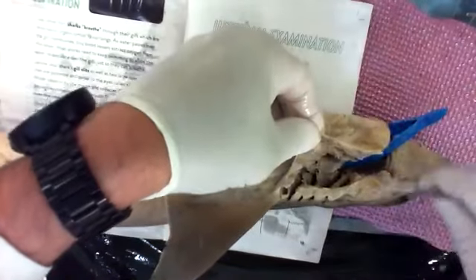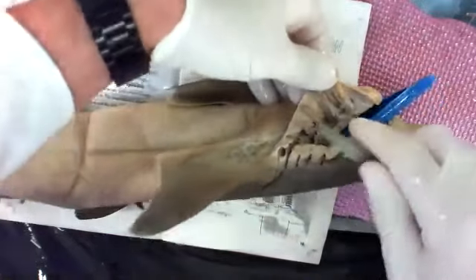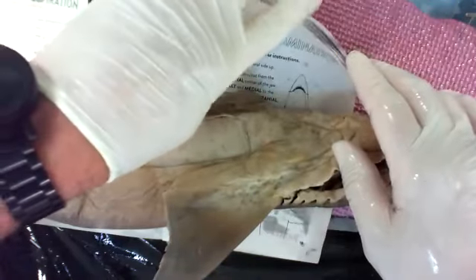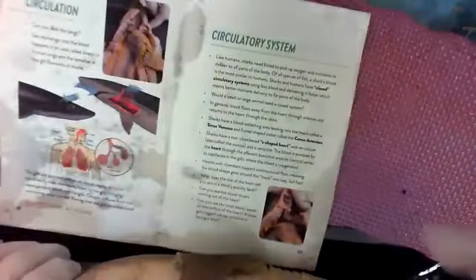If you look at the gills themselves, kind of a cool design. I don't know how clear you can see that, but probably not very. But it's like leaves or pages in a book, the way that they overlap. So that water has to flow in between every page, and the gills are full of blood vessels. So as the water passes by, the oxygen leaves the water and goes sucked into the gill, into the blood, and to the rest of the body. There's actually a picture of it on the next page. We'll come back. We'll make that other cut in just a minute.